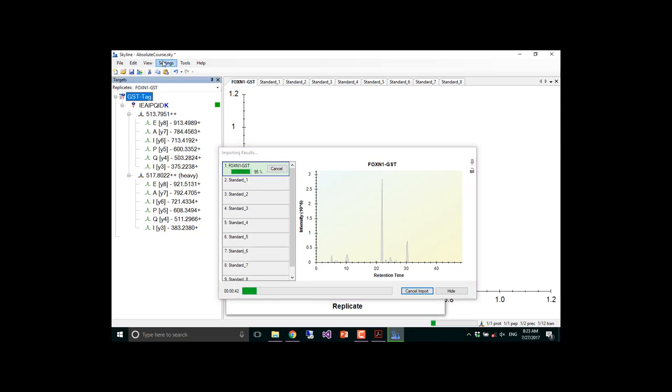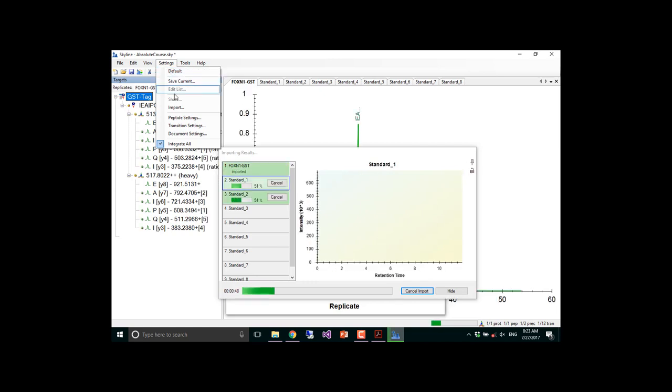So the settings, if you say settings default, so yeah, I could have made you all do that. If you want to start with default settings as a baseline, we went through all the tabs and we should have been synced up the same way. But if we wanted to start from default, we could have all just gone settings default.